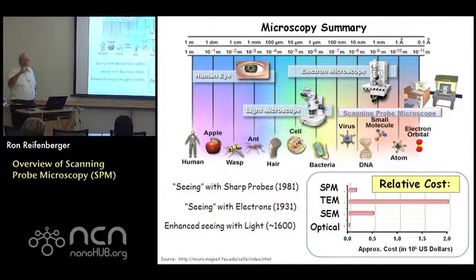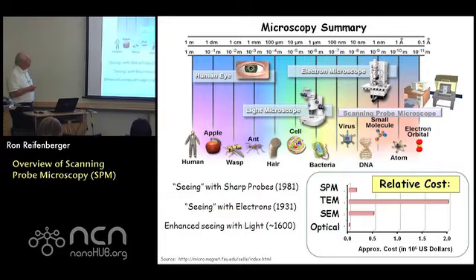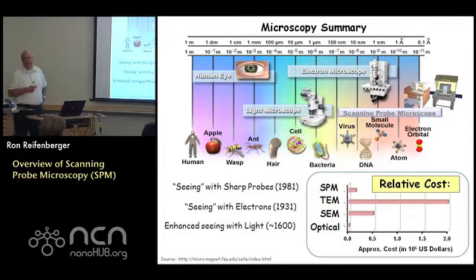And by measuring the amount of electrons reflected or transmitted through the sample, it was learned that you could considerably extend the range of the light microscope well below a micron, right? You could go all the way down into the nanometer length scale range. So these electron microscopes have been available for about 80 years, and they're also widely used in all labs throughout the world.